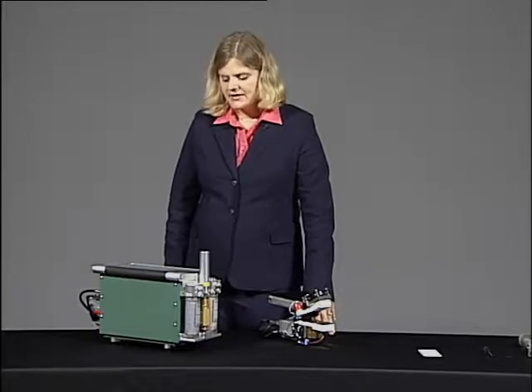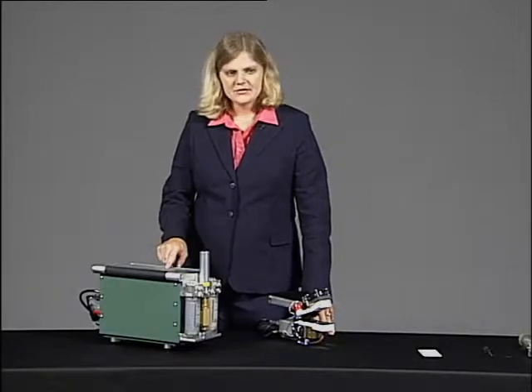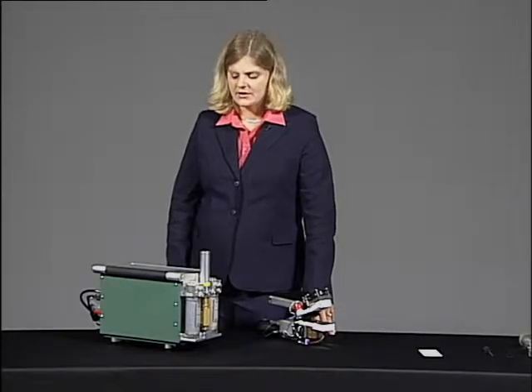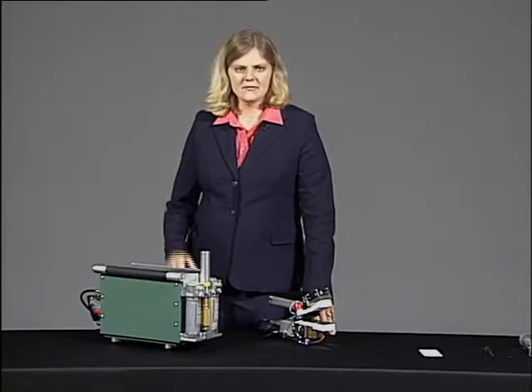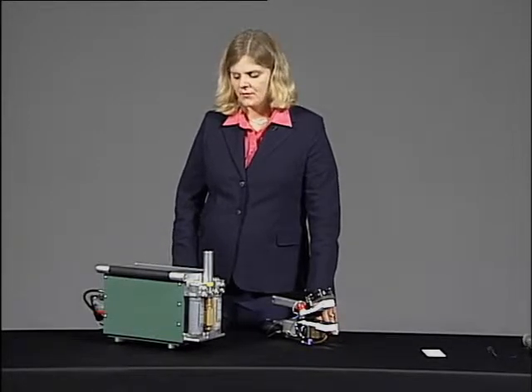It's also a good time while your instrument is warming up to check for your pressure. And pressure is located on line G. Now from day to day you will have variations in pressure as weather patterns change, but you'll have an idea of at your current elevation what your pressure should be, and just make sure that it looks reasonable.